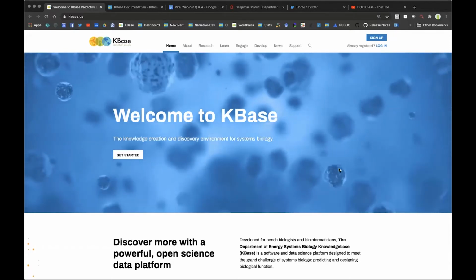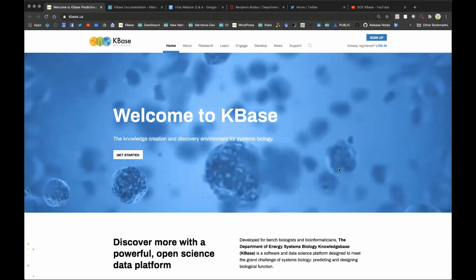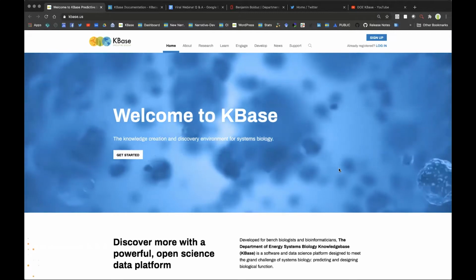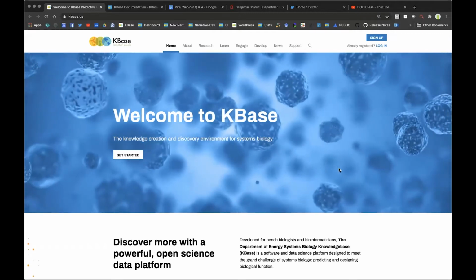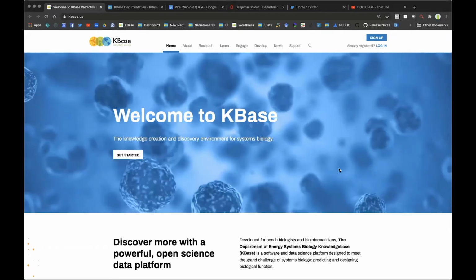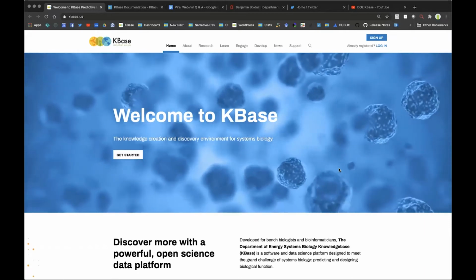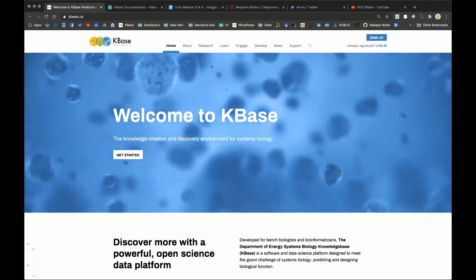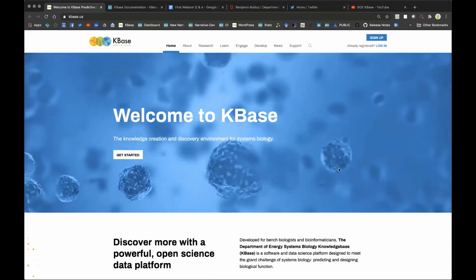On today's KBase webinar, we're going to hear from Ben Bolduc at Ohio State University. He is an expert in viral bioinformatics and has developed several tools and also has put those tools in KBase for all of you and the rest of the scientific community to use. So he's going to tell us all about our new viral analysis workflow on the system in just a little bit.